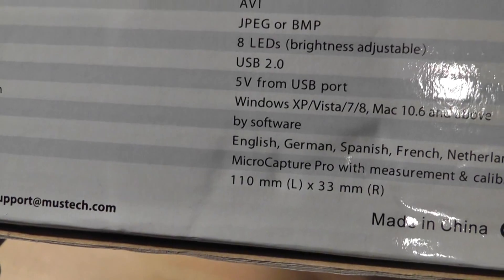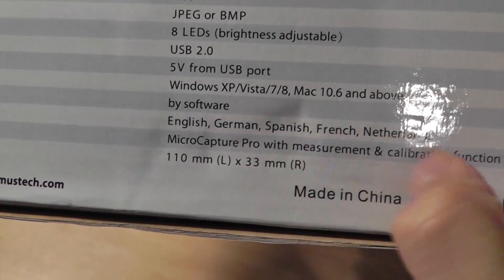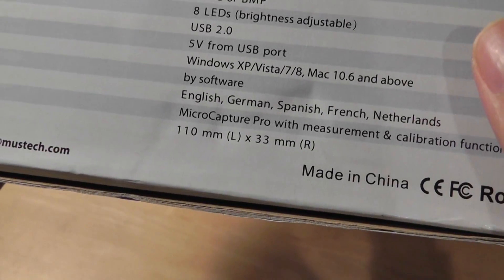It uses USB 2.0 and has 8 LEDs which are adjustable and pretty bright. You have the software which is available in different languages, and overall the size of the unit is 110 millimeters.